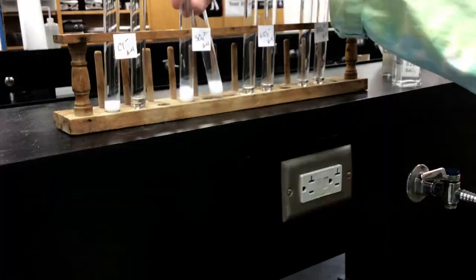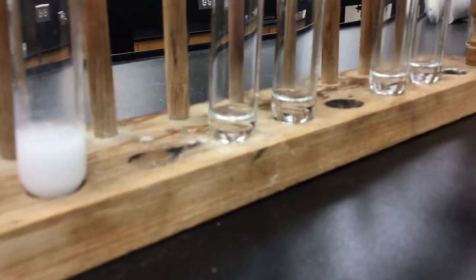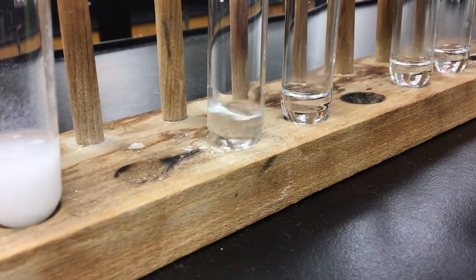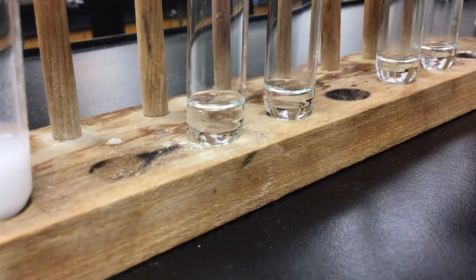We'll put those back. Now we'll do the sodium bicarbonate and your unknown. So looking for the presence of the bicarbonate anion. You're going to be looking for production of carbon dioxide most likely. And your unknown.